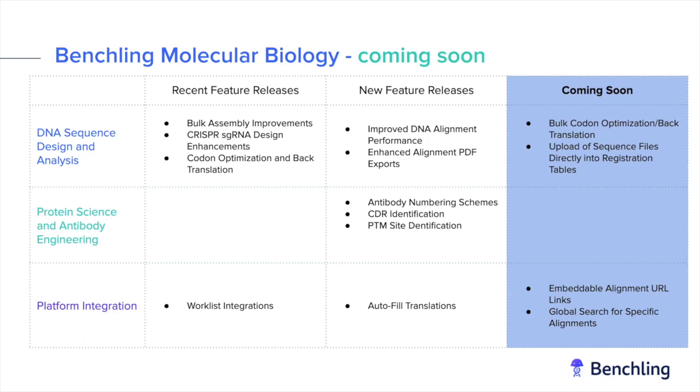And so we're really looking to bridge the worlds of small and large molecule development and make sure that any of our users who are currently working with modified RNAs, DNAs, or peptides are able to accurately model, design, and attribute results to those entities within Benchling. So that's going to be a pretty large theme of work for us for the next few quarters, but I just wanted to call that out as something to look forward to in the future.